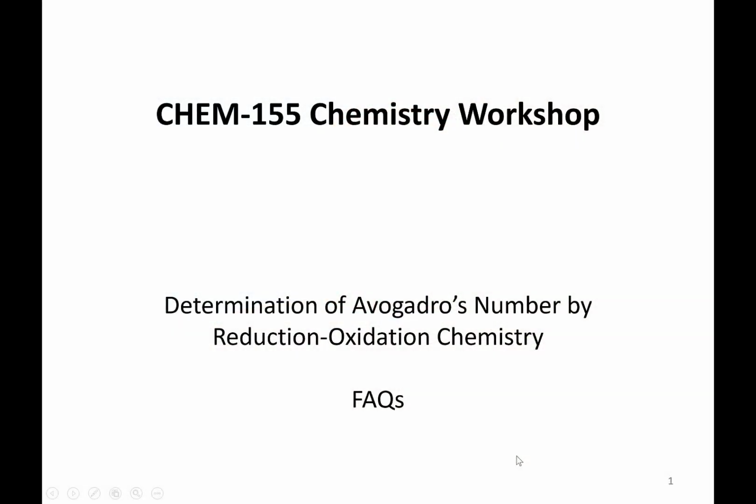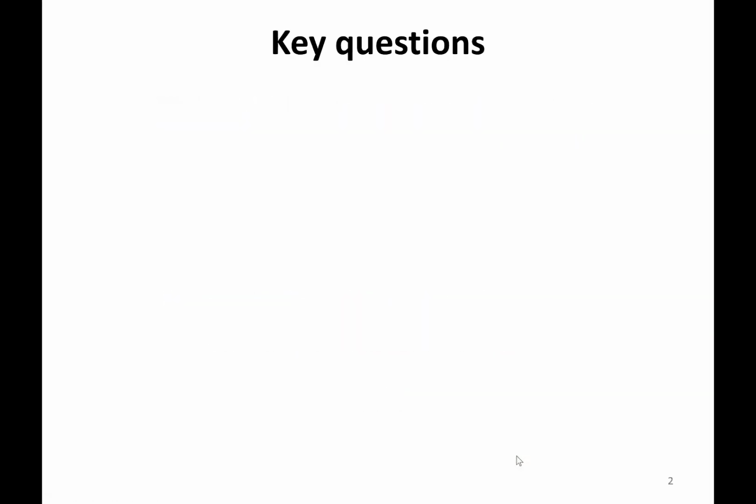We'll jump over to PowerPoint. So let's look at some of these key questions. And the first question, as I mentioned, is what's the goal of this experiment? And so simply the answer is we're going to determine Avogadro's number.